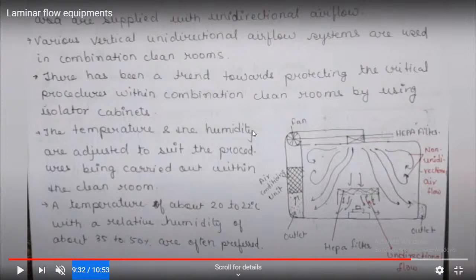The temperature is about 20 to 22 degrees Celsius, with a relative humidity of about 35 to 50 percent. So relative humidity ranges between 35 to 50%, and the temperature is about 20 to 22 degrees Celsius.